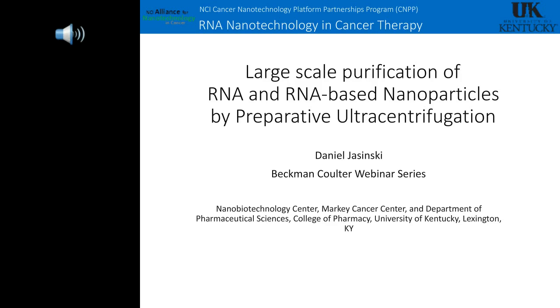The next question relating to RNA purification is, which method do you most commonly use? Is it electrophoresis? A lot of people use PAGE gels. Chromatography, size exclusion, or ion exchange, ultracentrifugation, which is today's topic, organic extraction, or I have never purified RNA.